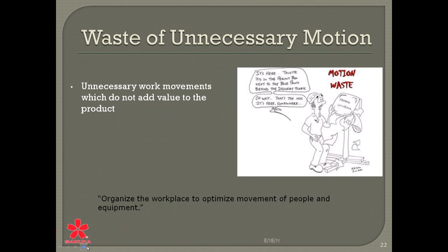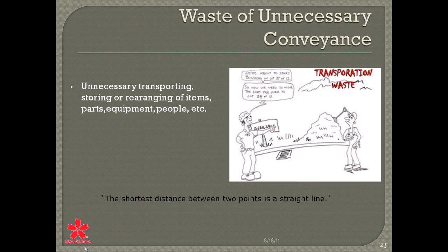There is always unnecessary motion in your lab. When you look at your lab, you see there's a staining machine over there, and there are some microtomes over here, and there are grossing benches at the other side, so try to place them in a structured way according to the process. And some unnecessary movement for transporting or rearranging items. You always see it in the lab, somebody is shoving his stuff all around the lab and not in the place where it should be.